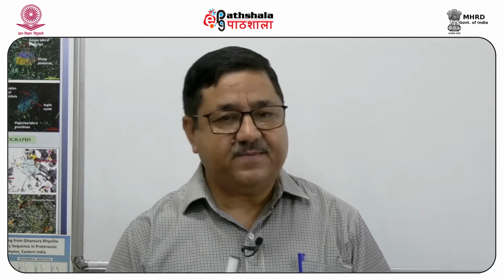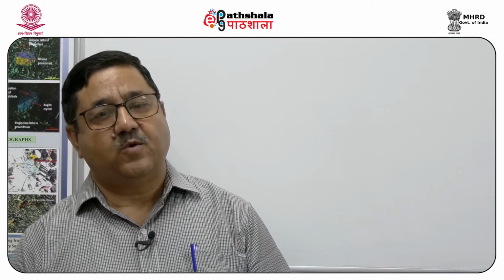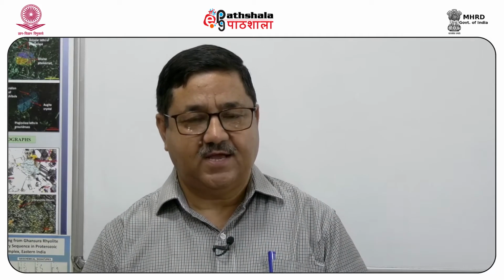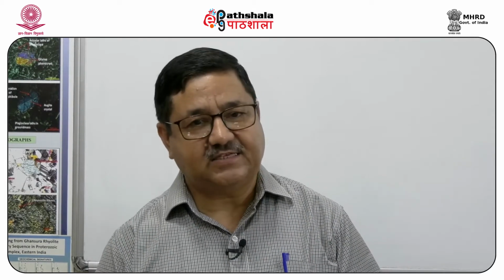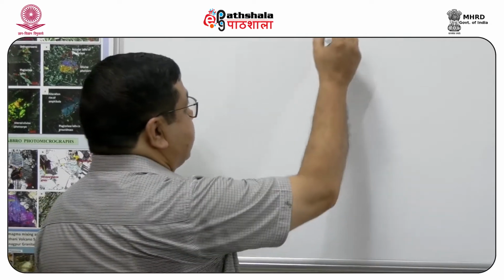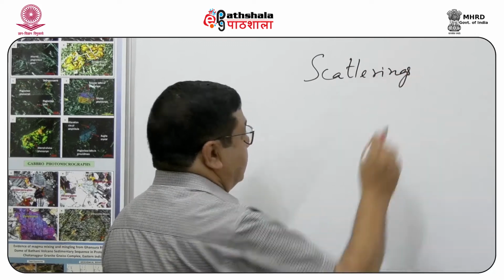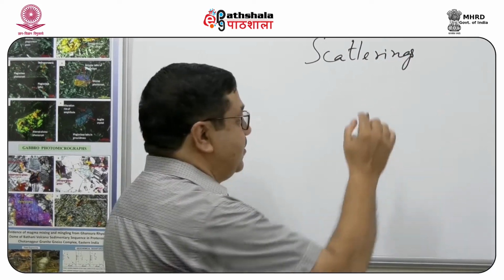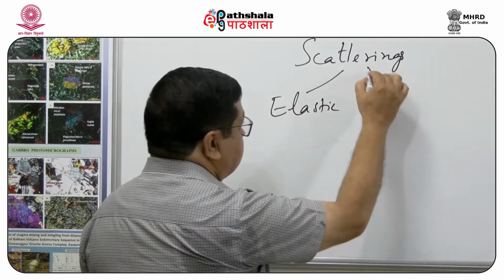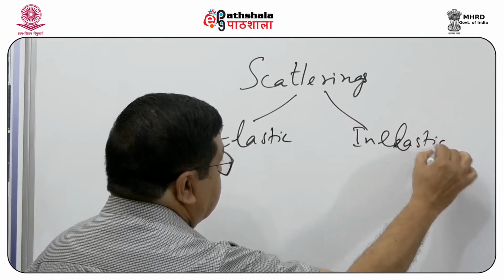As far as the SEM is concerned, two major kinds of things happen when an electron beam interacts with matter, and these can be classified in two ways. That is, we can call them scatterings of the incident particles, which can be either elastic or inelastic.